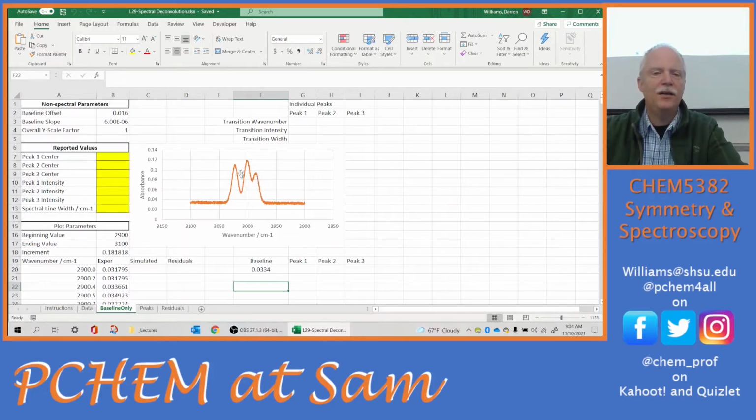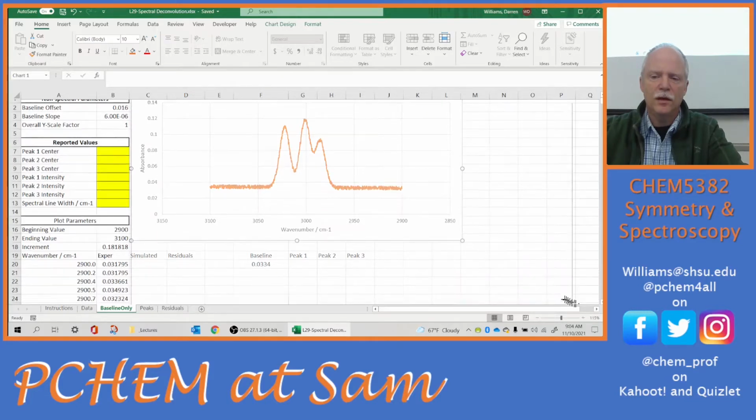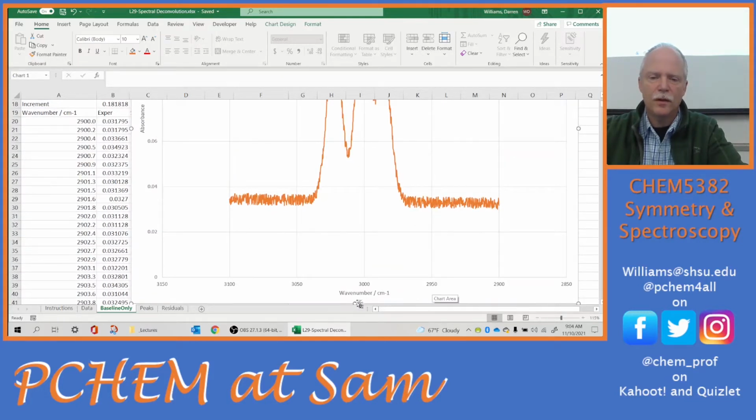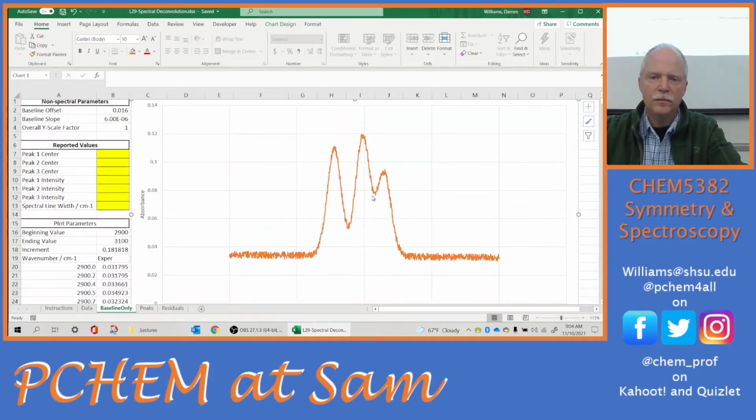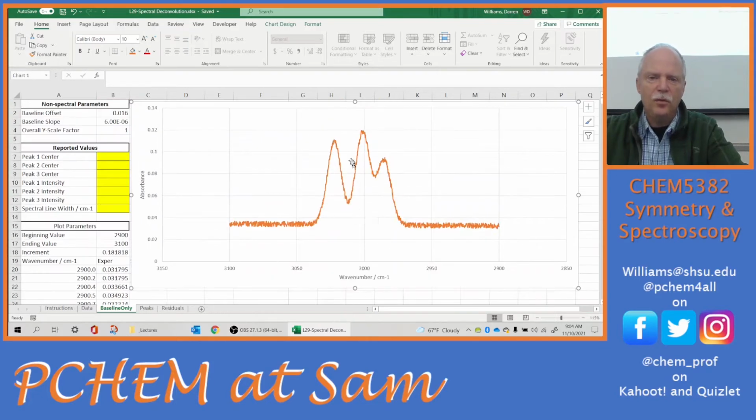We're trying to find, here's an example spectrum. Let me go ahead and zoom in on it so you guys can see it. I'll make it big. Ooh, too big. Okay. Right, so if this is our spectrum, we could come in with a traditional peak picking technique and hover over that and get our peak center of 3022.5 and our peak height of 0.11. We could write that down, and that's what we do at an undergraduate level.